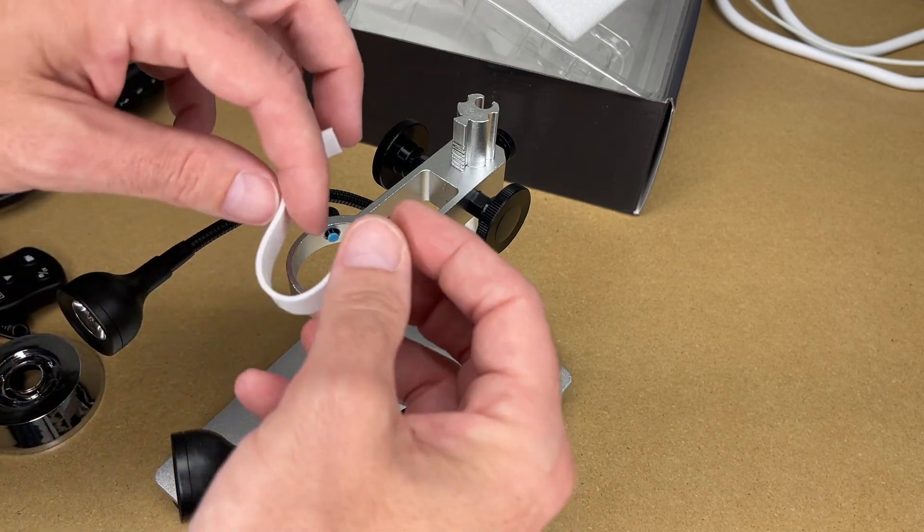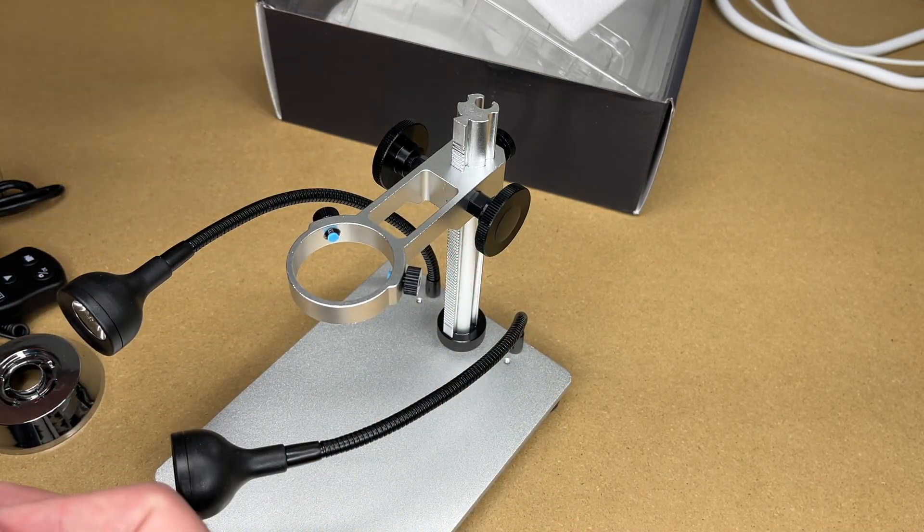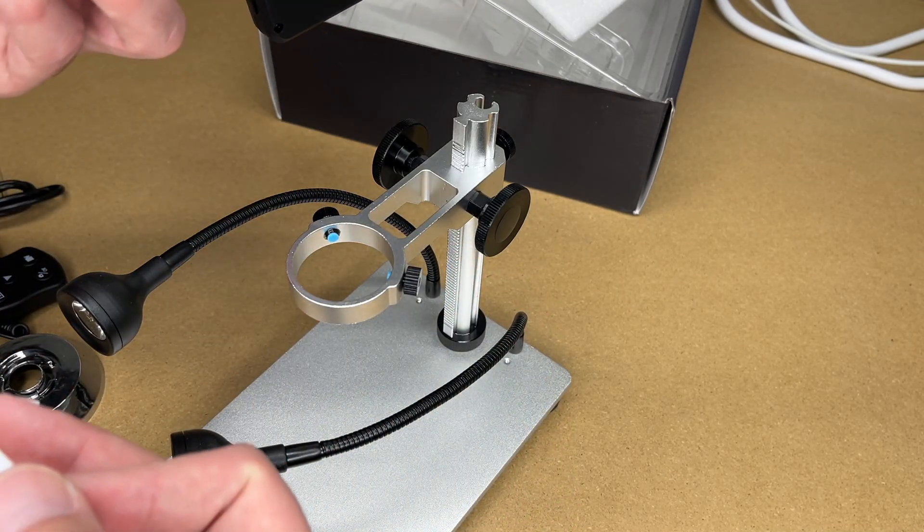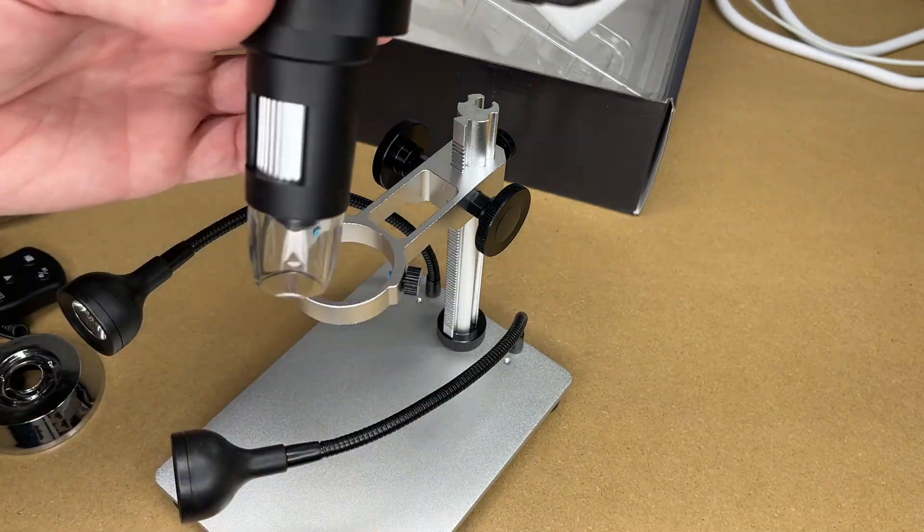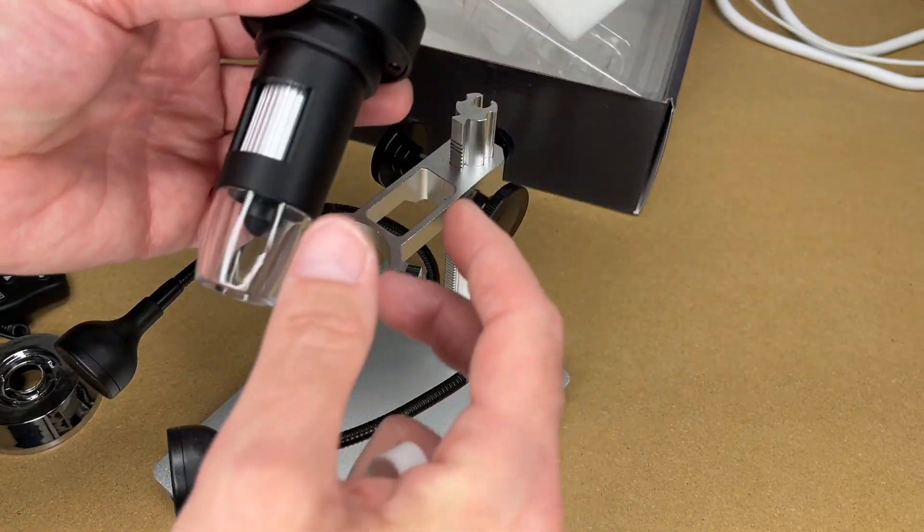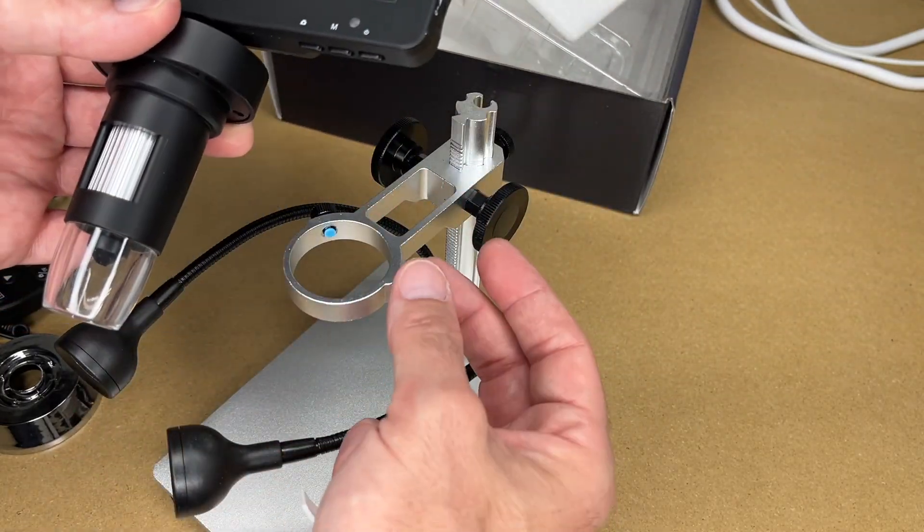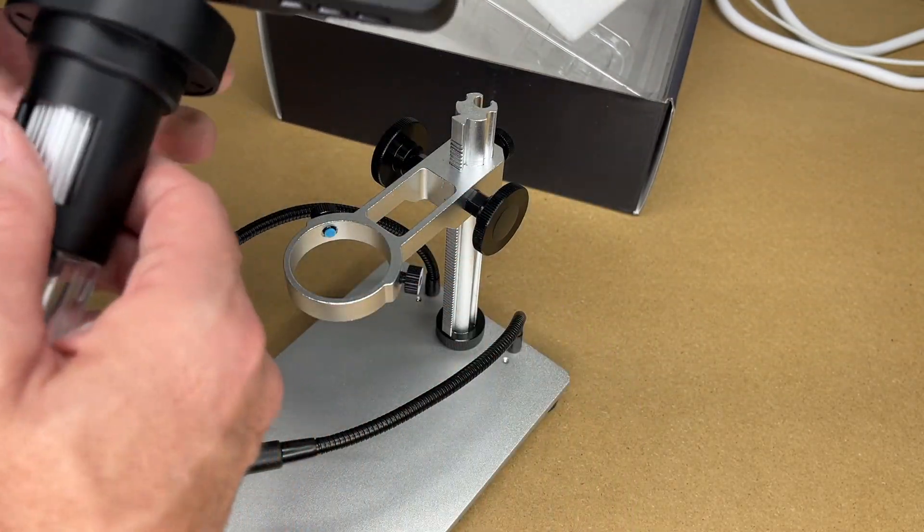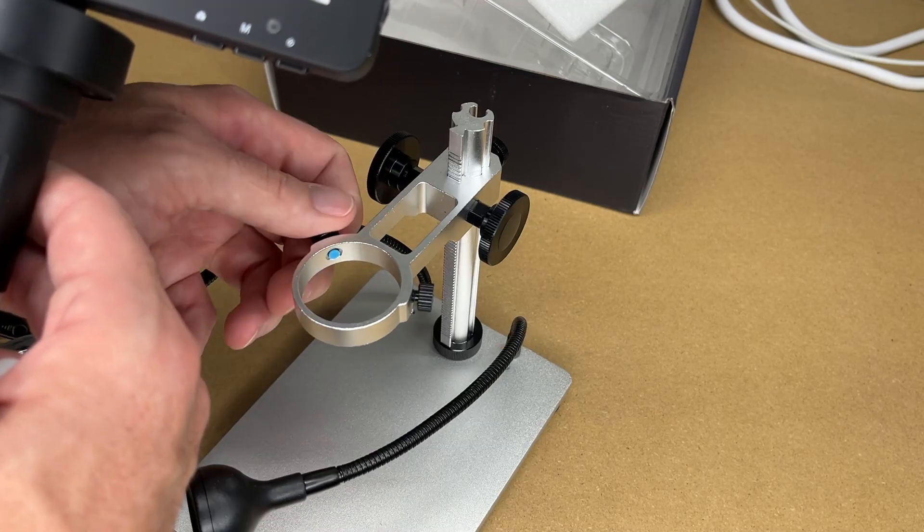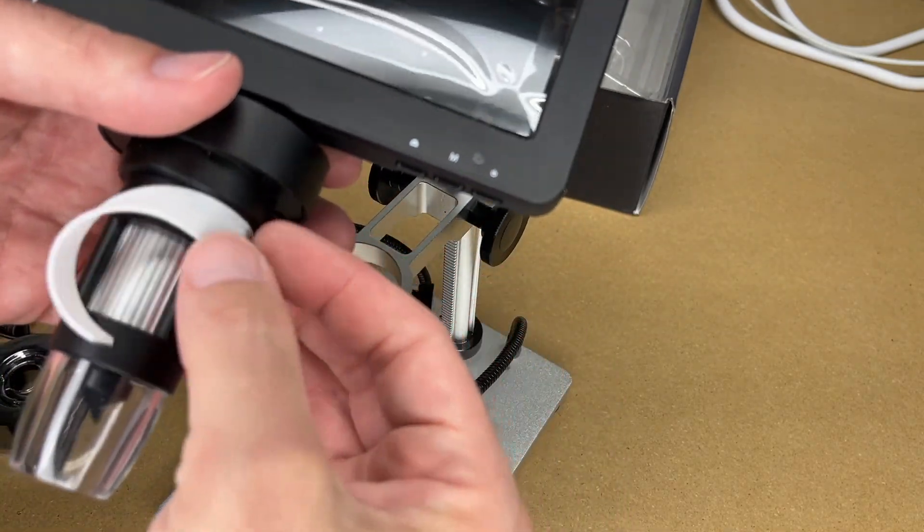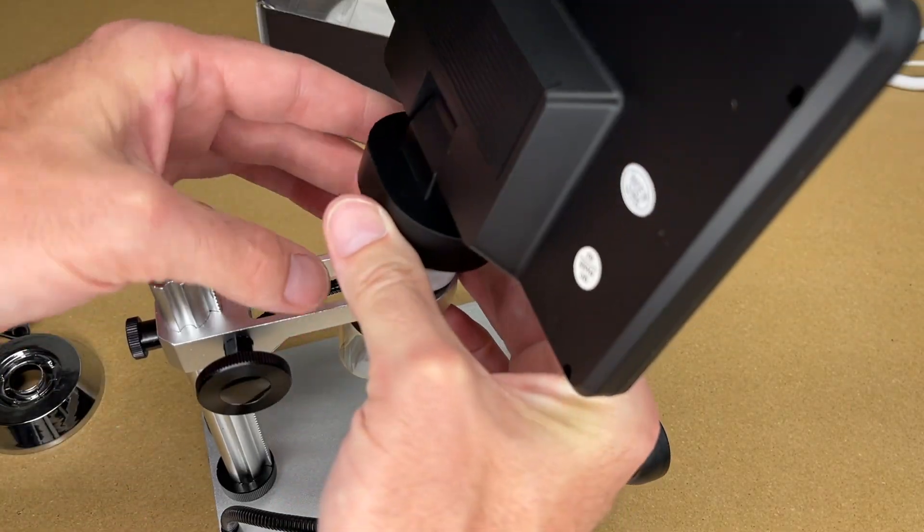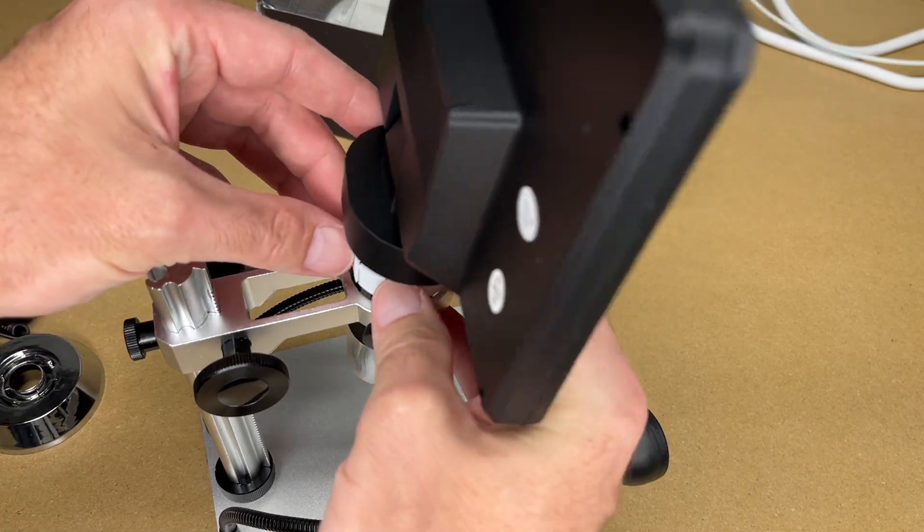Then we have this piece of rubber here. I'm not sure if that should go on here first. Let's try it. I'm just going to stick this in temporarily. So that's going to clamp around this area. So I'll loosen these nuts up here, I'll put this rubber around here and then I'll slide it down in there. Kind of bunched up there. Let me do that again.